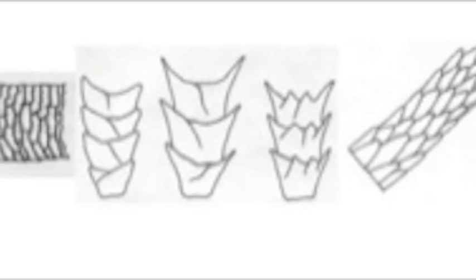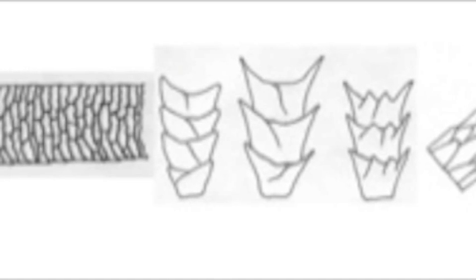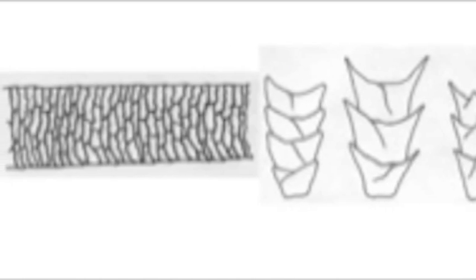The cuticle scales always point to the distal end of the hair. They form into 3 different pattern categories. The coronal structure is a crown-like pattern that resembles stacked cups and is common in thin hairs. Spinous or petal-like cuticle patterns are triangular in shape. The imbricate or flattened cuticle structure involves many overlapping scales that are wide and short.